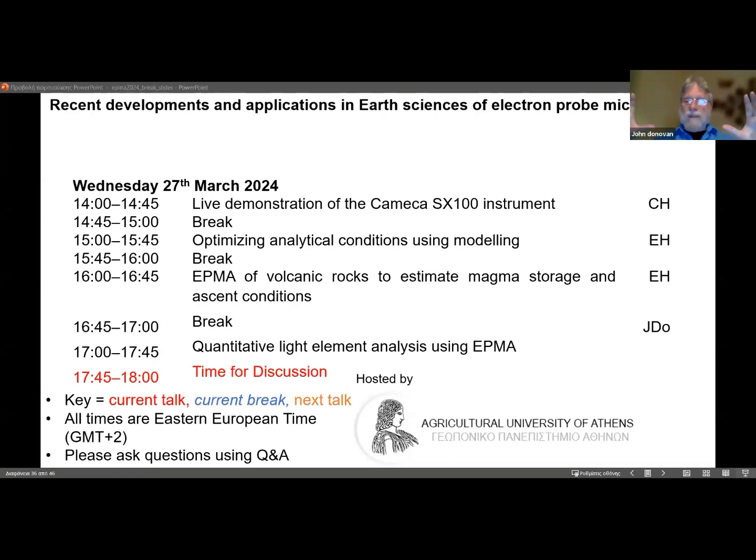And so the code is a little complicated, but basically we compile all the intensities from each of the data types together from each spectrometer for the unknown and the standard. And that's the critical point that people miss, is that you need to do this for the standard as well as the unknown. And then, of course, the matrix correction is fine.